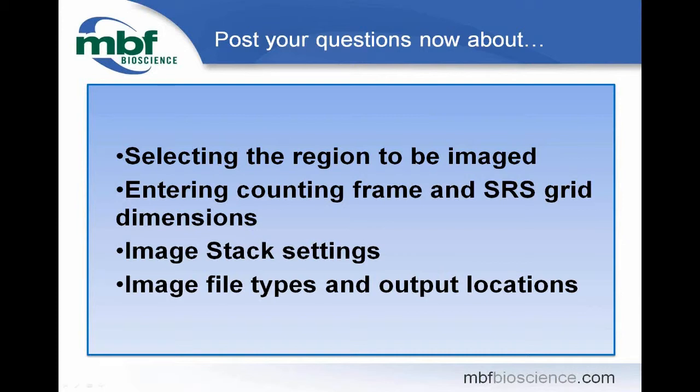Jeffrey asks, what is the exhaustive grid option in the layout step? Jeffrey, for some highly infrequent events, such as, for example, co-labeling of BrdU and, let's say, NeuN, for these types of events, it may be impractical to do a systematic and random image stack acquisition within one contour. Even if you are using serial sections that don't come one after the other, let's say that you were using tissue where your serial sections were every 6th section, you may want to exhaustively sample all of the BrdU stained cells in each of your sections.